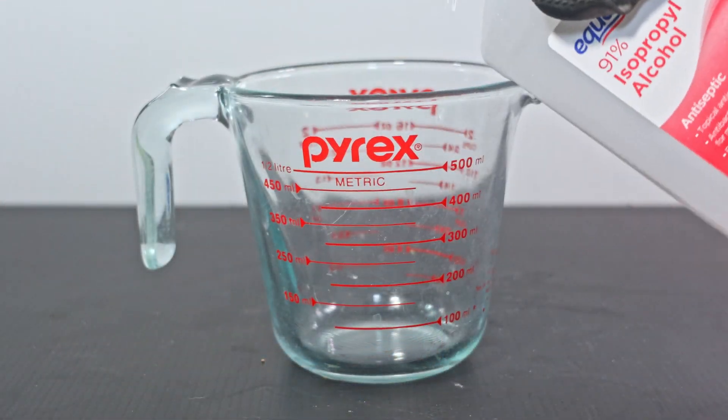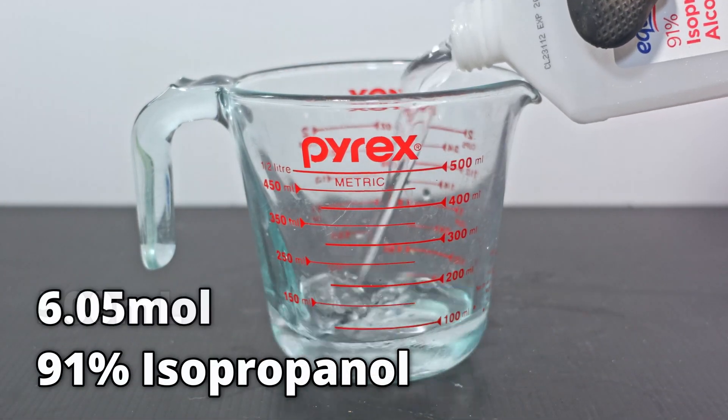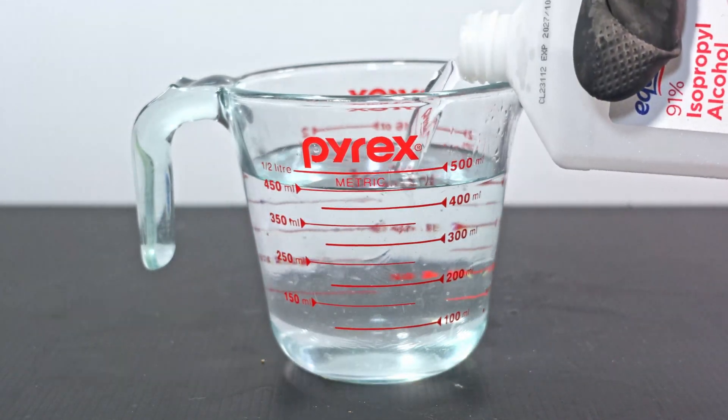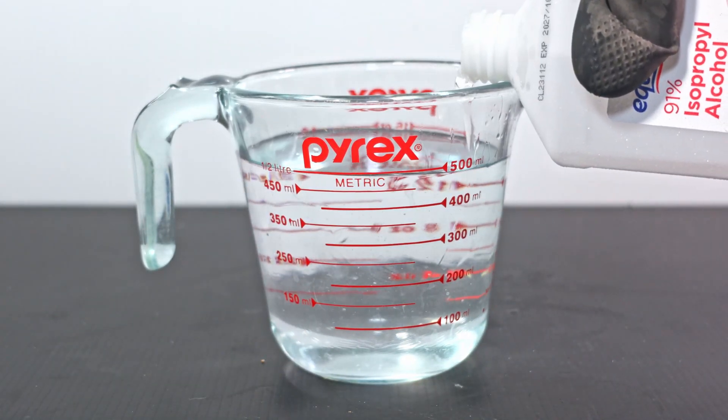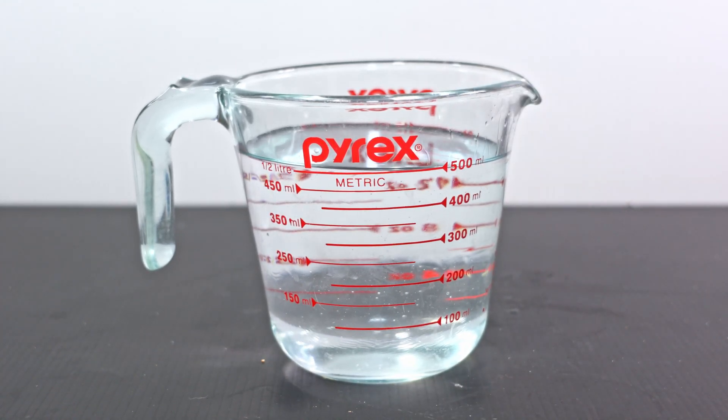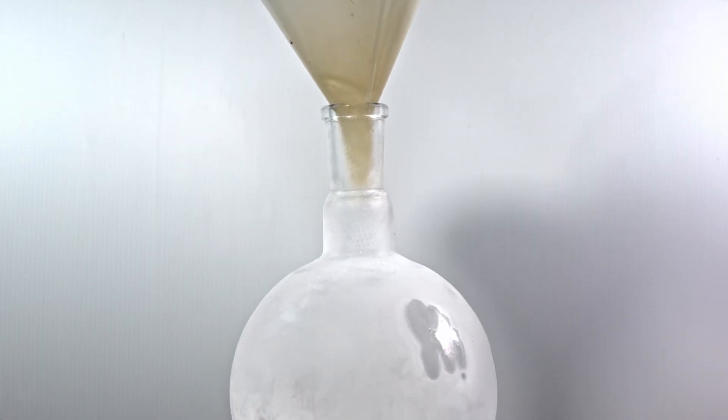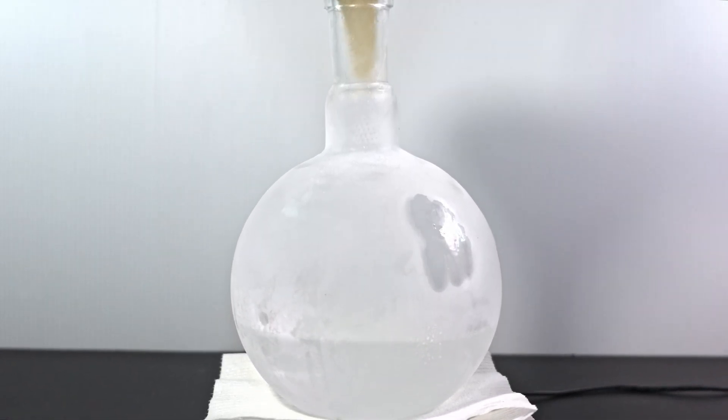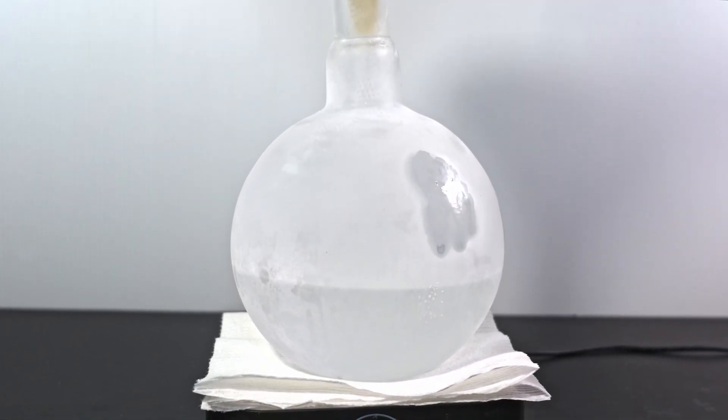Next, I pour out 500 milliliters or 6.05 moles of freezing 91% isopropyl alcohol. You could use 99%, but note that the extra water does help buffer sulfuric acid's oxidizing effects. I pour this into a pre-chilled 1-liter boiling flask to further keep it cool. Remember, the colder you start, the less likely bromide will oxidize into bromine.